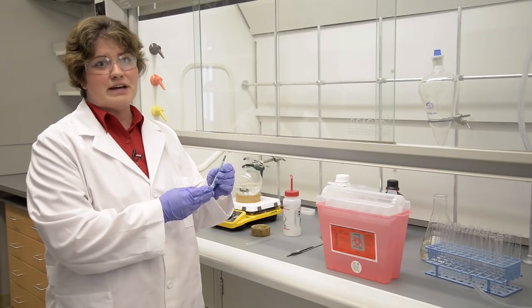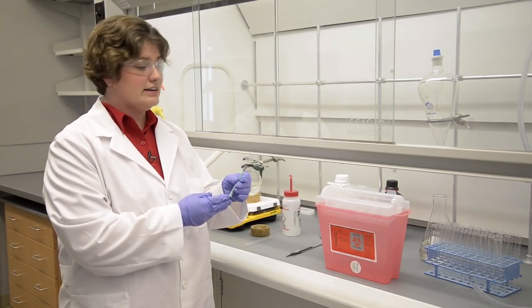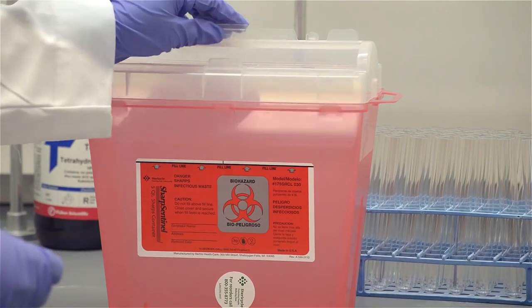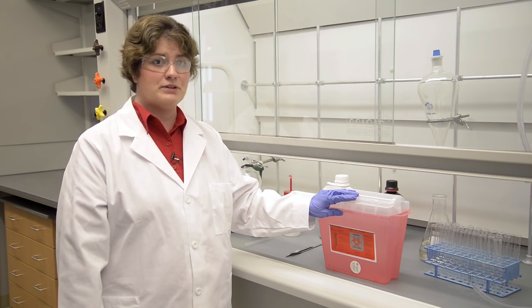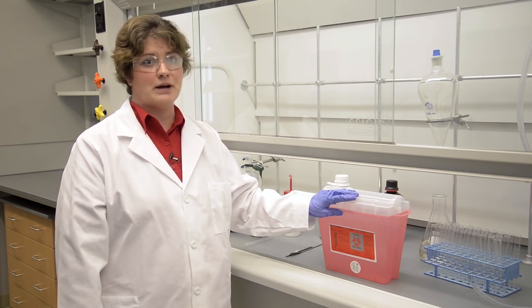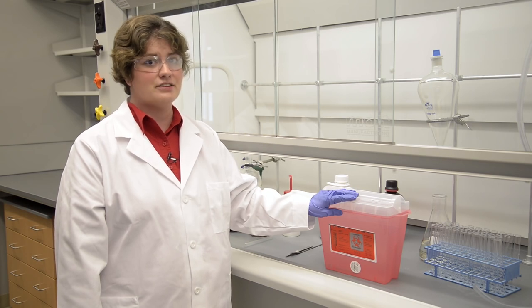When you're finished using metal sharps, you can place them in a red plastic hard-sided container, such as this one. When this gets full, you can place it in your biohazard burn box if it's contaminated with biohazardous materials, or you can place it in your glass trash box if it's not contaminated with biohazards.